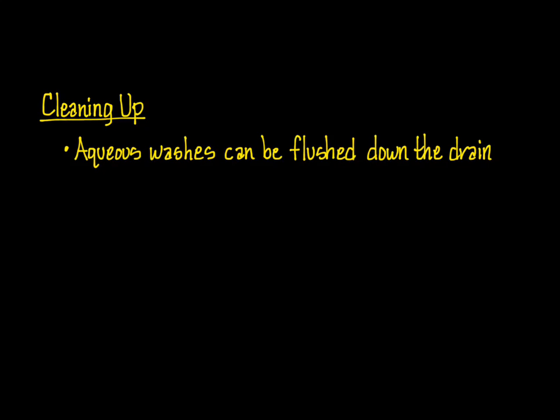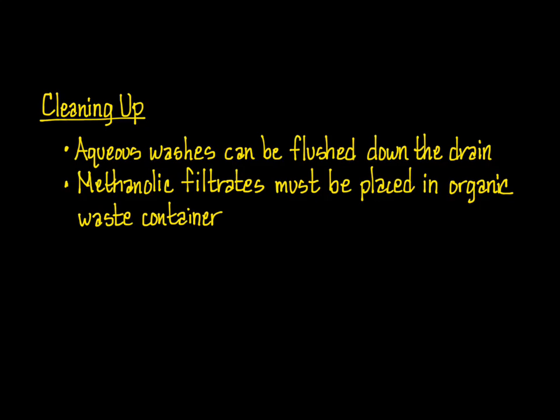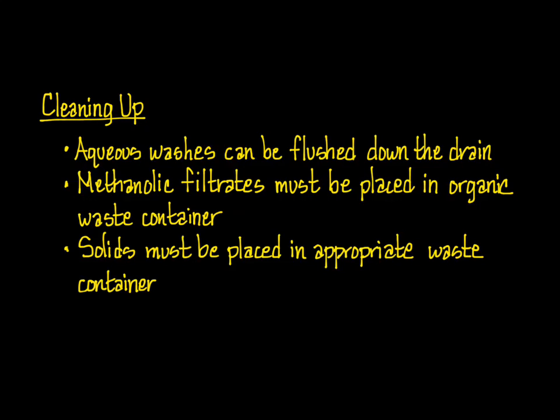Cleaning up for this experiment is straightforward. The aqueous washes can be flushed down the drain. The methanolic filtrates from the recrystallization must be placed in the organic waste container, and the solids go in an appropriate waste container.